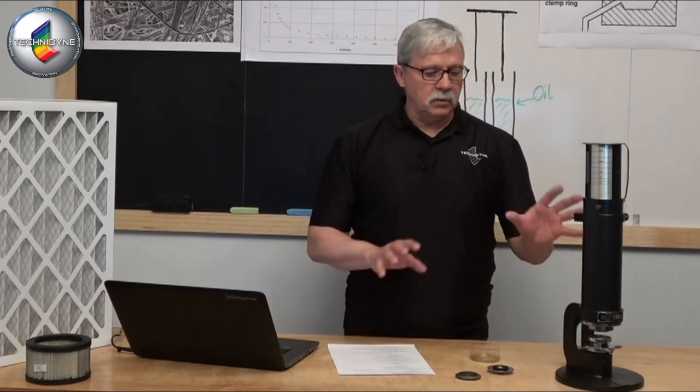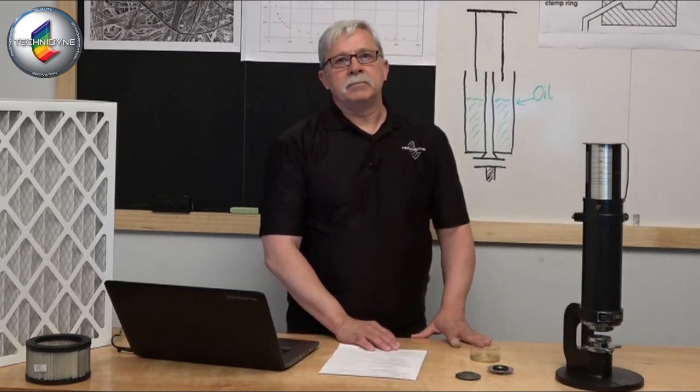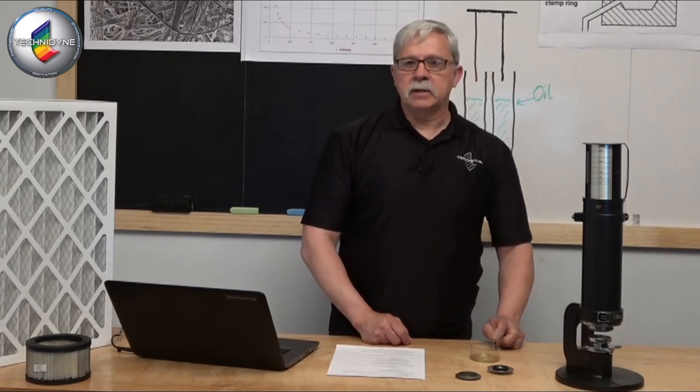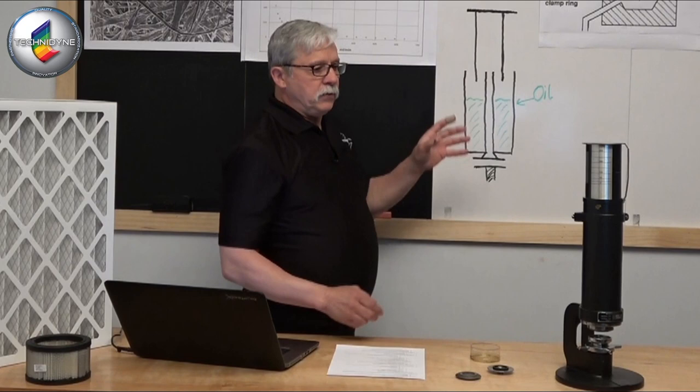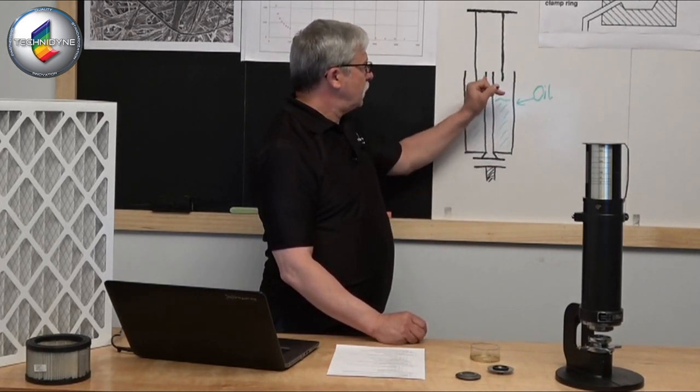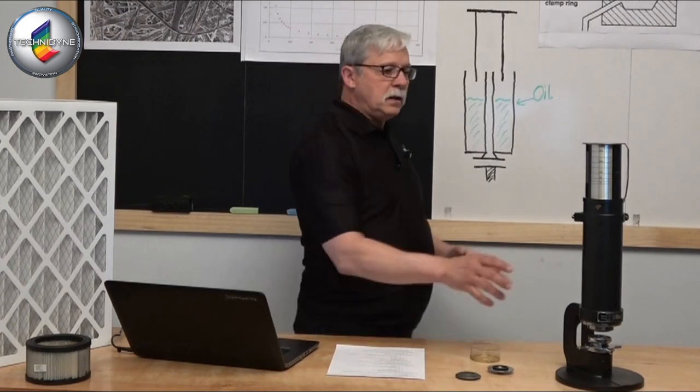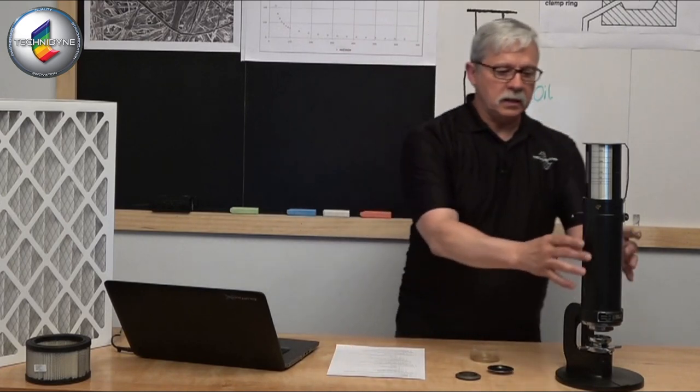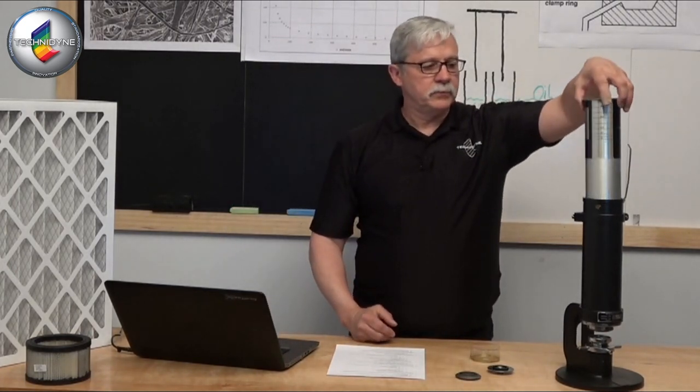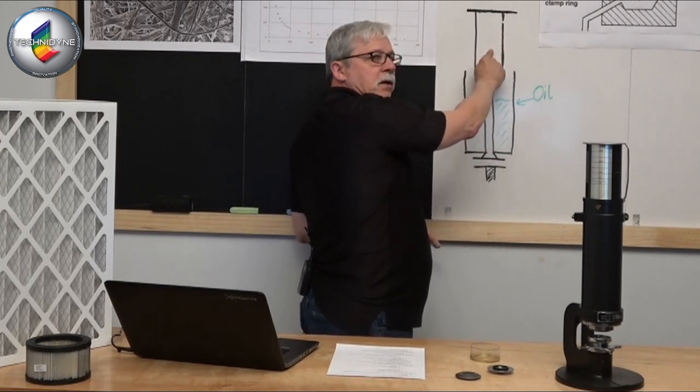So the Gurley method, the Gurley densometer method had a fairly unique way of creating some pressure. It's very portable, you can see I don't need any external air supply, I don't need any external electronics, anything of that sort. So what they did was if you can envision this cylinder, this outer cylinder here as being a two-walled cylinder so that we can create a cavity all around the circumference of this device. And in that cavity we can put some oil inside that cavity to seal, to help make our seal. When we take our top cylinder, the inside cylinder, we place that inside. Now essentially what I can do is I can capture an air pocket right in here.